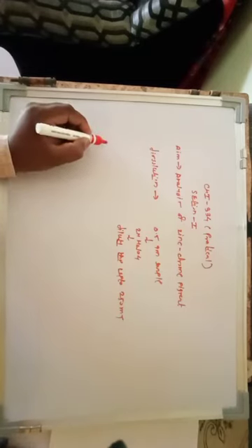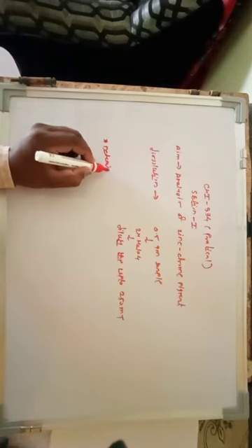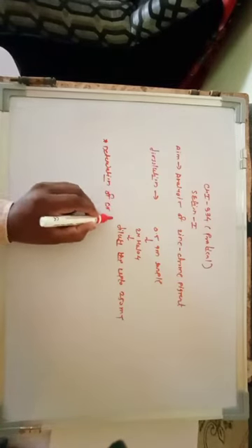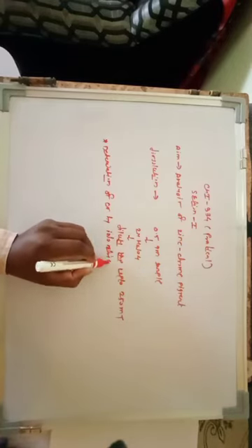So let us discuss the first point, the determination of chromium iodometrically.